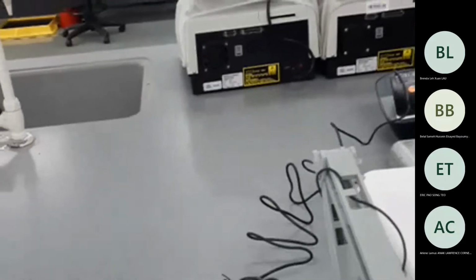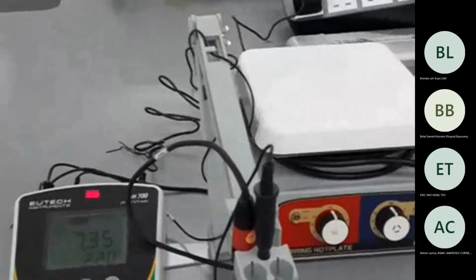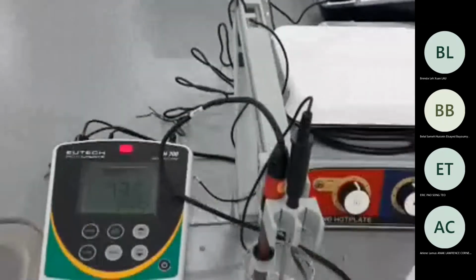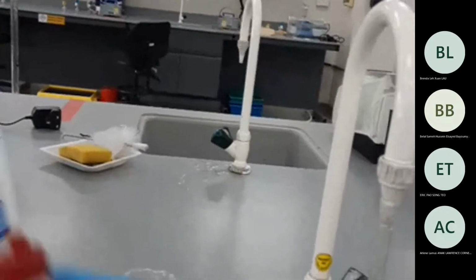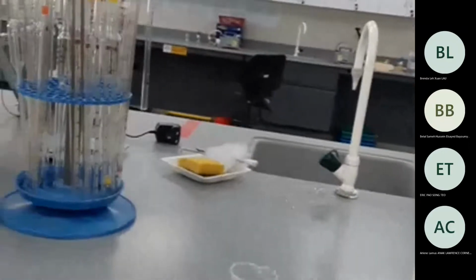Yeah, you can. 25. Yeah. And I think, Lynn, you can just take 7 point... Yeah, it's ready now. 7.35 for your tap water. Okay. For her, the tap water pH is 7.35, and probably you can try and take the distilled water once again, because your one was quite low compared to others. So just to get it right, to remove the confusion, let's see once again how it becomes.